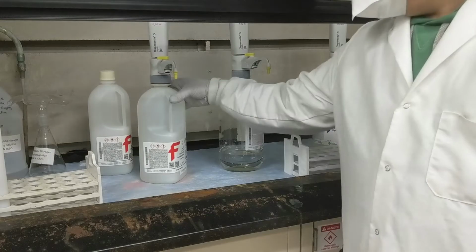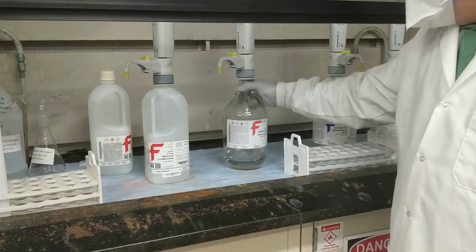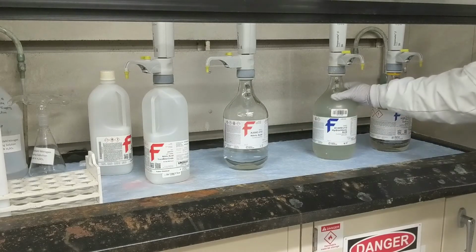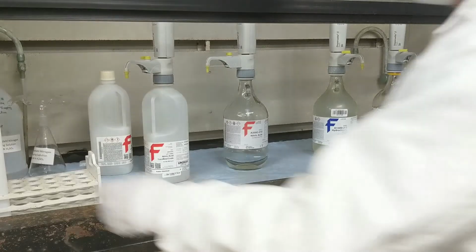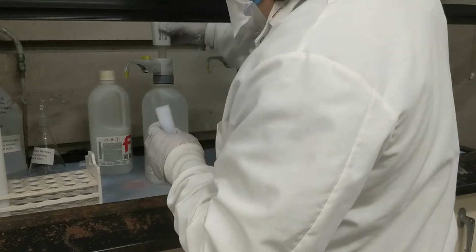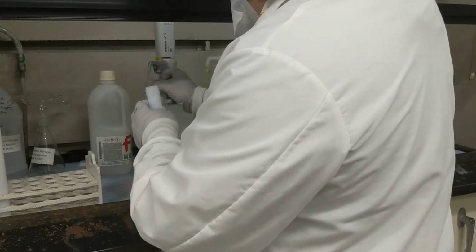So this is the point where our 3 digests differentiate from each other. In our acid hood, we have going from left to right our trace metal grade nitric acid, our regular grade nitric acid, hydrochloric acid, and sulfuric acid. We won't be using the sulfuric acid today, but our standard digest is 10 milliliters of our trace metal grade nitric acid.